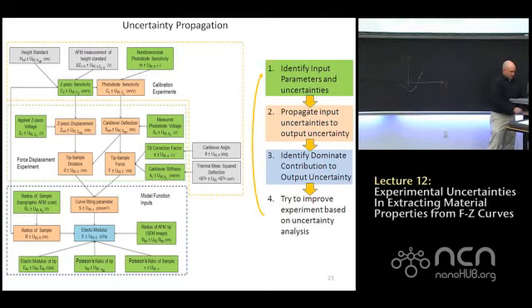And those are all what I've colored green, so I can define all those as input. We're going to go through that process I discussed earlier, which was using the curve fitting procedure, the DMT model, and data collection. So we do all that, and we get to our elastic modulus, which is blue. What this chart represents is the interrelationship between those parameters.